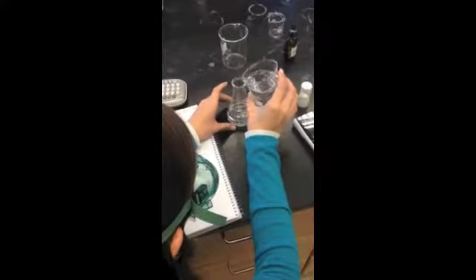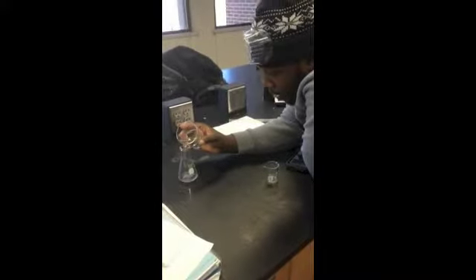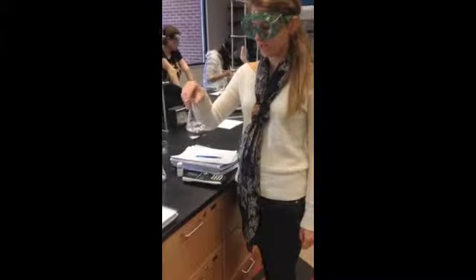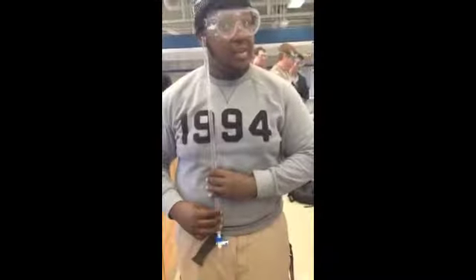We filled each beaker up with 50 milliliters of water. After filling with water, add a small amount of KHP to each beaker. And we're pouring. There's the 50. KHP may dissolve slowly, so if you stir it around like this, it helps, and you want to do every sample at the same time. The initial volume for all 3 experiments was 50 milliliters.